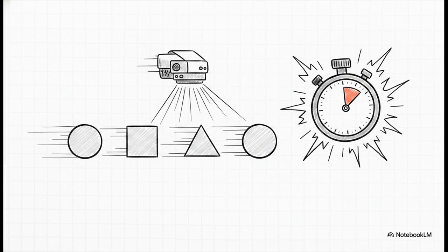Because of this, the mass spectrometer has to be capable of obtaining at least one full scan per second over the mass range you care about. And honestly, if you're looking at a narrower range, it needs to scan even faster than that.